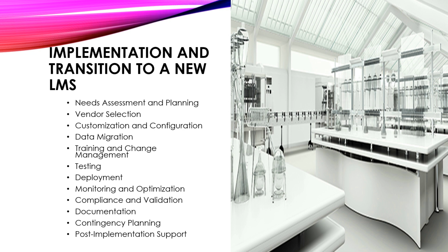Training and change management. Develop and deliver comprehensive training programs for staff to ensure they understand how to use the new system effectively. Communicate the reasons for the change, address concerns, and involve staff in the transition process to facilitate buy-in and acceptance. Testing. Conduct thorough testing to ensure the system meets requirements and functions as expected. Verify data integrity, system performance, and compliance with regulatory requirements.